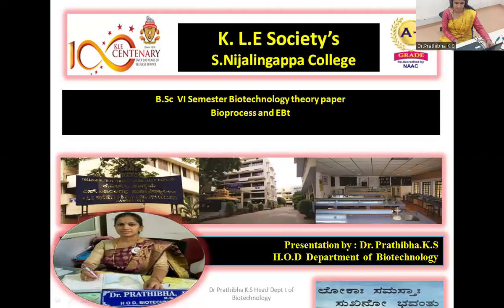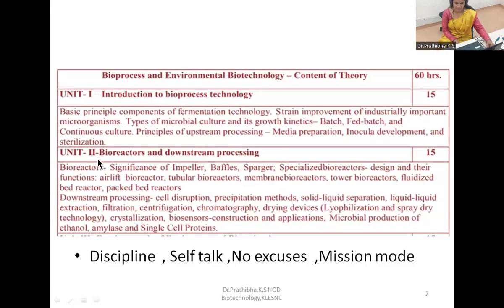Good afternoon, students. Today in this lecture class, I'm dealing with bioprocess related to bioreactors. This comes under the paper Bioprocess and Environmental Biotechnology, that is Unit 2, Bioreactors and Downstream Processing. Today I'm dealing with bioreactors, that is the significance of impeller, baffles, and sparger.